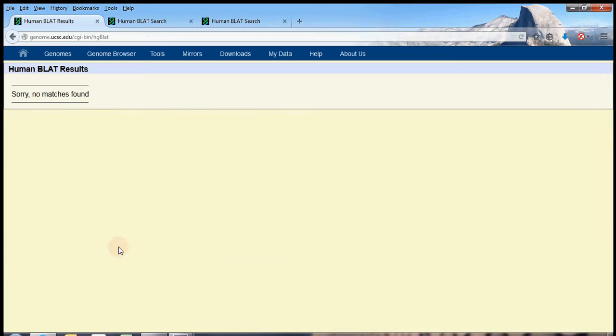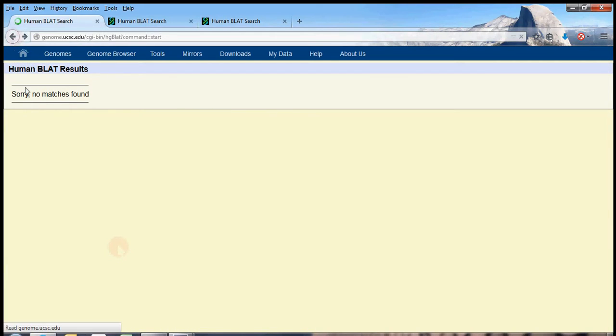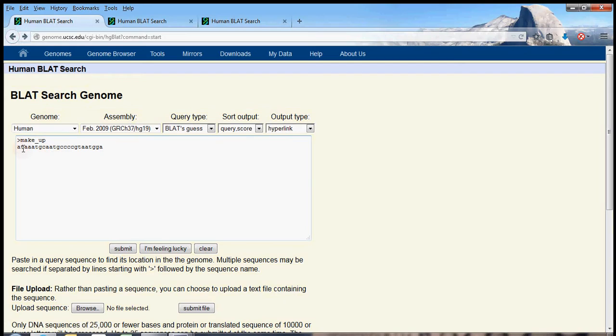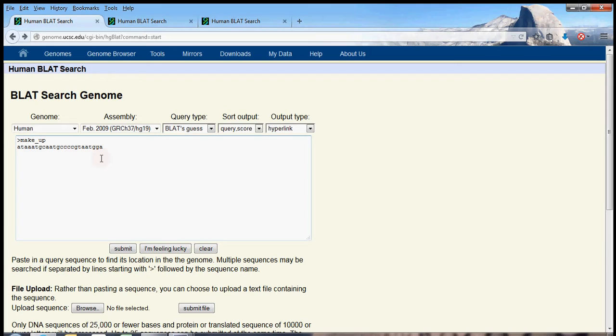BLAT did not find any matches, and that kind of makes sense because this sequence is about 25 letters long, and a random sequence that's 25 letters long is actually not likely to be found in the 3 billion base pair genome.